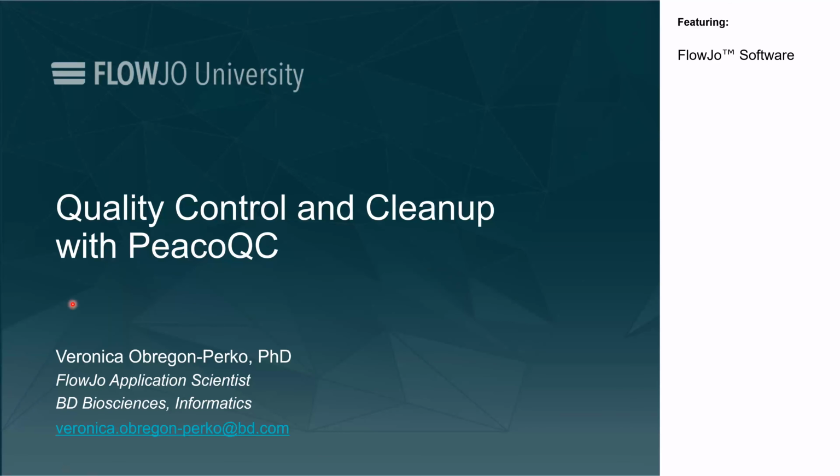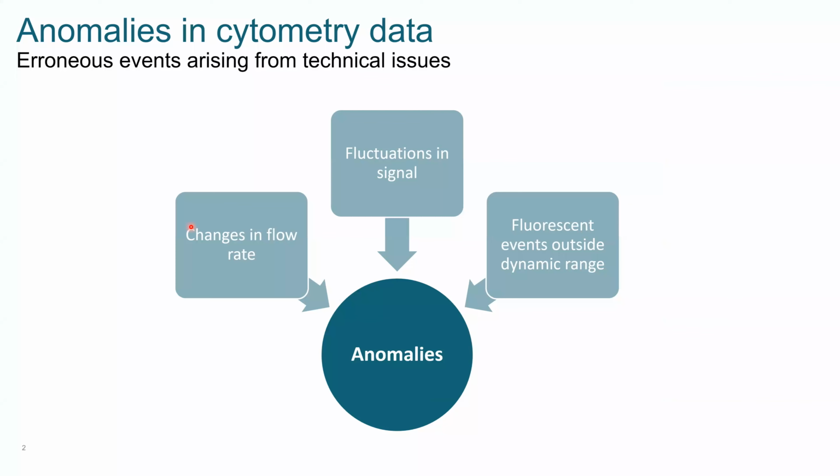All right, well, let's go ahead and get started. So today we're going to be talking about a cleanup tool. I thought it would be nice to lay the foundation for why we need cleanup tools in the first place. Why do they come into play for flow cytometry data?